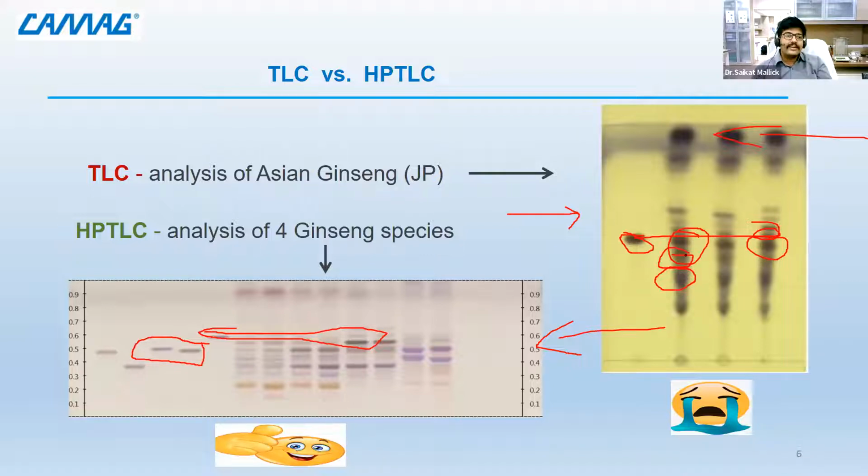You don't get a right output. So in order to get a right output here, you are in absolute control of what component is there at what level. Suppose I get a response over here at a spot, I know that a higher quantity level was present over here, because of which the response is coming. Maybe I'm getting a response over here. So I'm very specific in understanding the location of the compound, which is important at a later stage for doing our analysis.